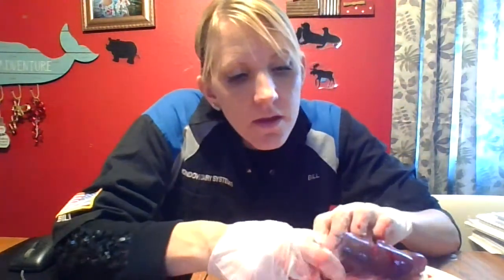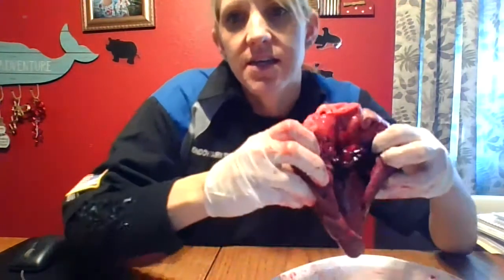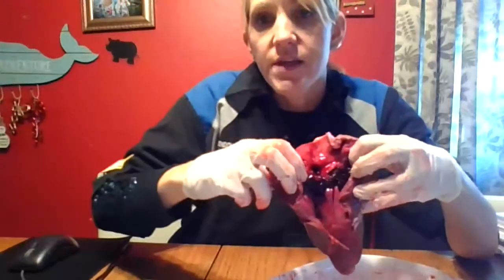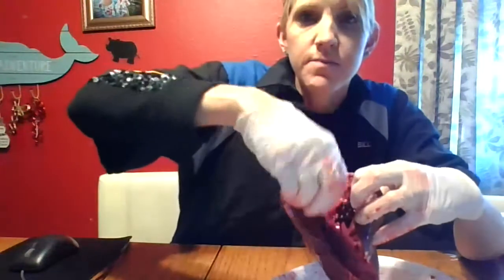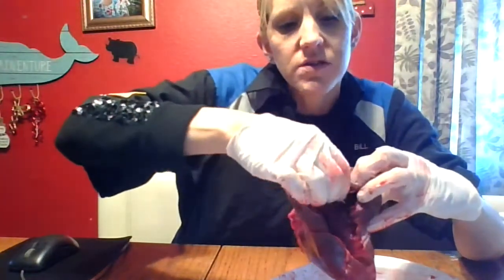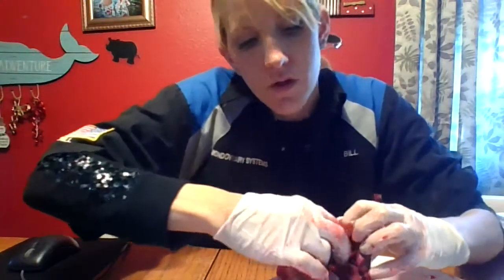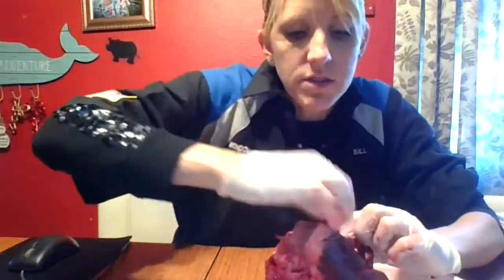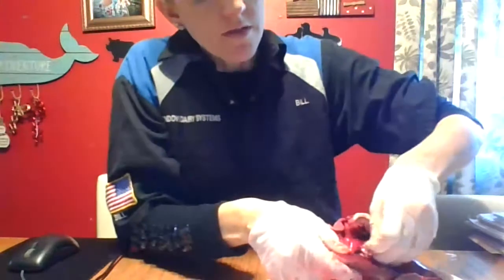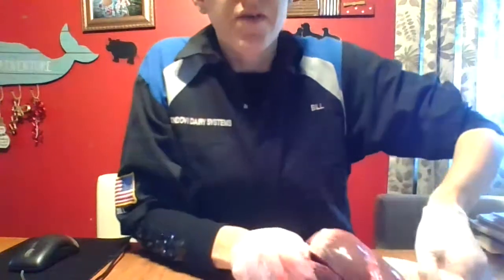We have a blood clot! Look at that — isn't that fabulous? This dark stuff here is a blood clot — looks like jelly. Don't put it on your toast. This one's ginormous! So you're going to want to take the blood clots out — get those out of the way. Now I'm going to be able to see this really well.